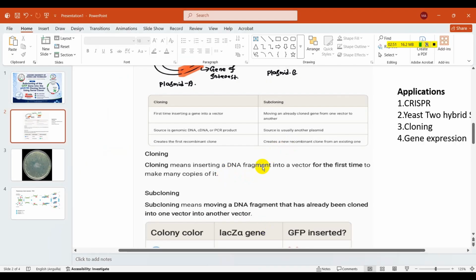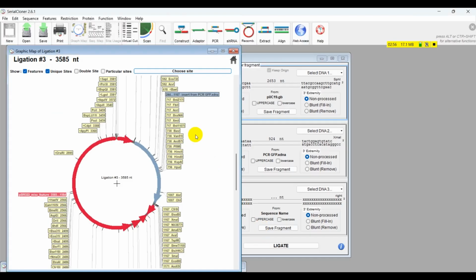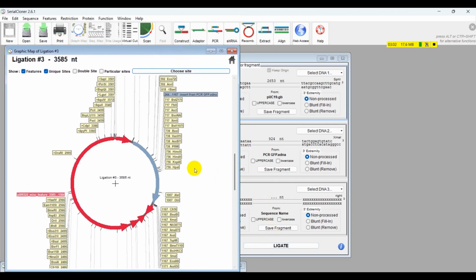For that, because an expression vector has some strong promoter like the T7 promoter, it will help to express the protein more strongly. And another reason, cloning vector is small in size. It can take a small amount of nucleotide sequences, but for larger sequences we can use BAC, I mean bacterial artificial chromosome, or yeast artificial chromosome.